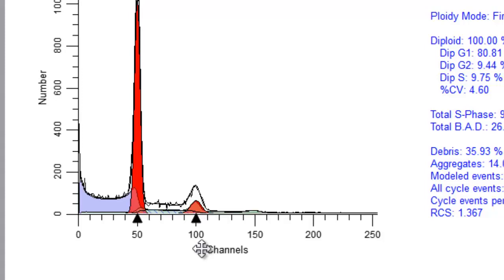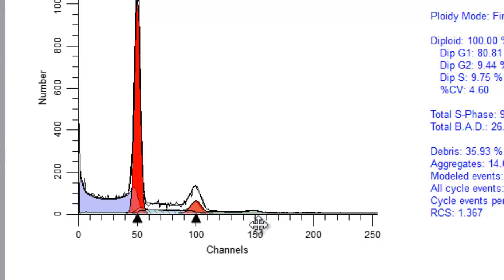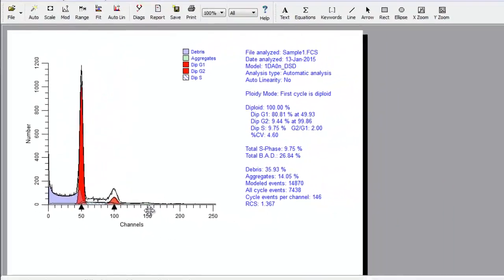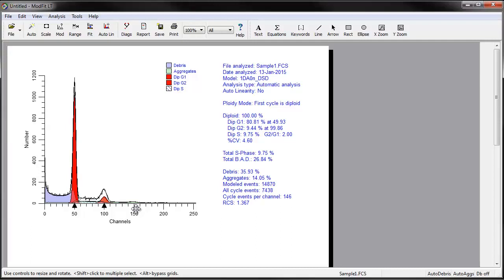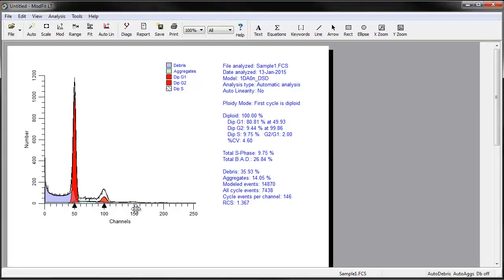The second major effect is on the aggregation model component. This model component assumes, for example, that doublet positions are twice singlet positions and triplet positions are three times the singlet position. ModFIDLT uses the linearity setting to transform the data prior to creating the theoretical shape of the aggregate distribution. Thus, linearity also affects the positions of computed aggregates and affects the model fit and the S-phase estimates.